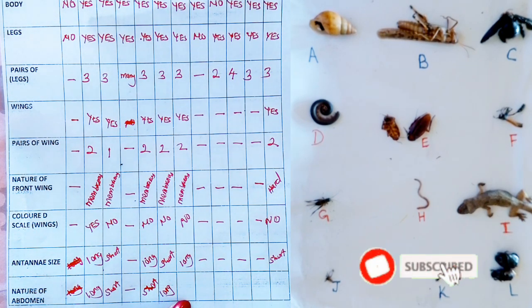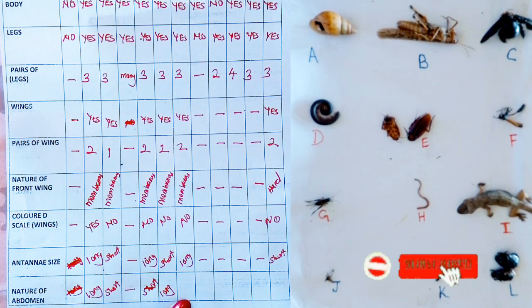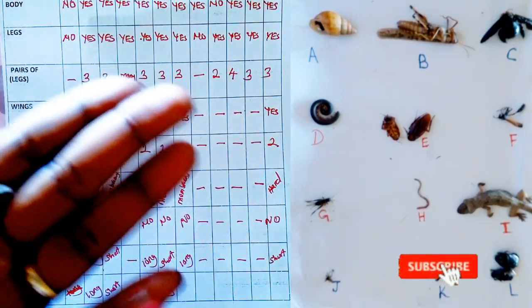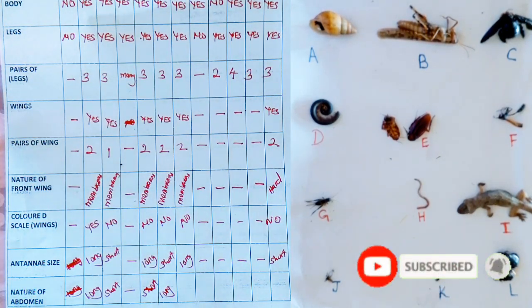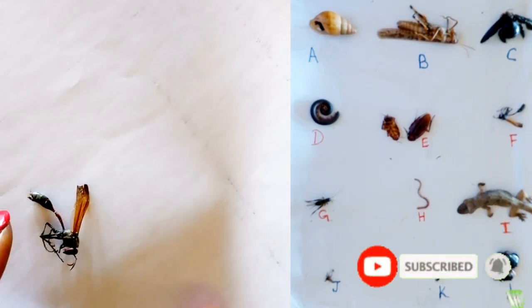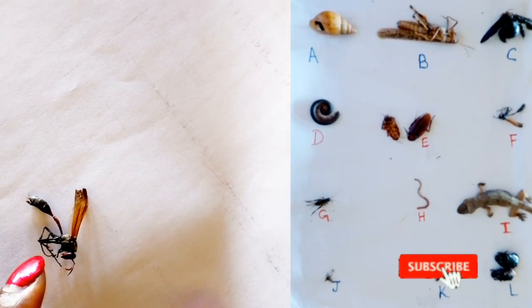Constricted. It's as if it has been pinched. Okay, guys, this is what we are talking about. We are trying to argue whether this one has a long or short abdomen.